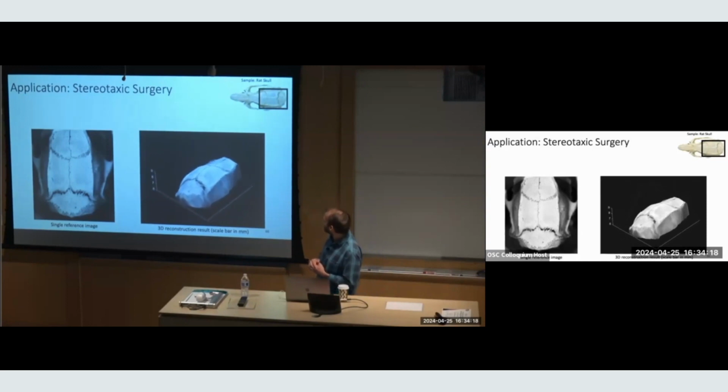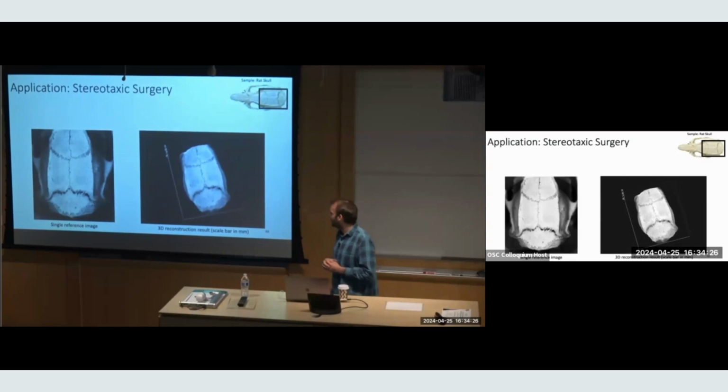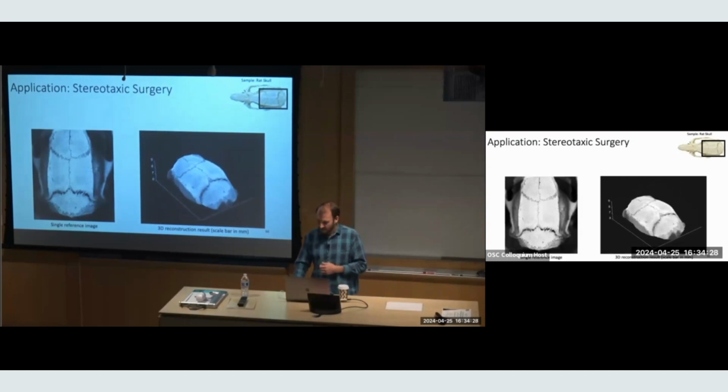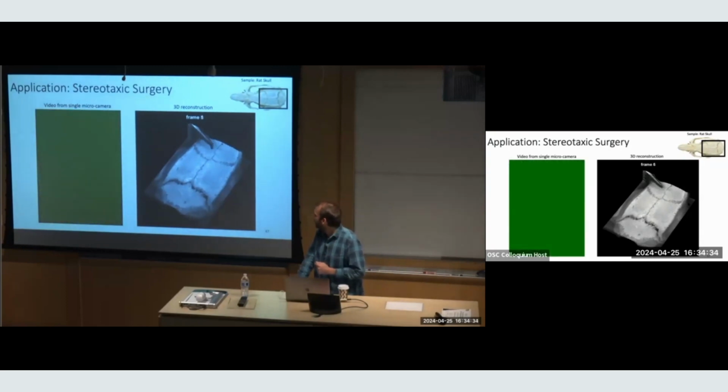Sorry, the scale bar didn't transfer over. But it's quite large, actually. It's on the order of maybe 3 centimeters long is the scale that we're observing here. And then we can capture, this is just a test. This isn't an actual surgery. Whoops, sorry, that was just the 2D image. But here's the tool in 3D moving and touching the surface.